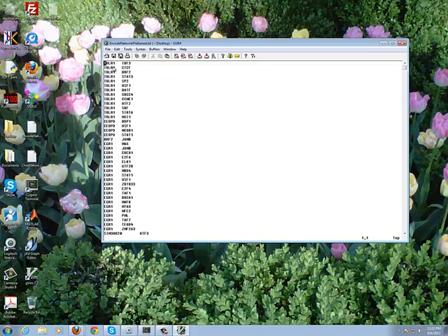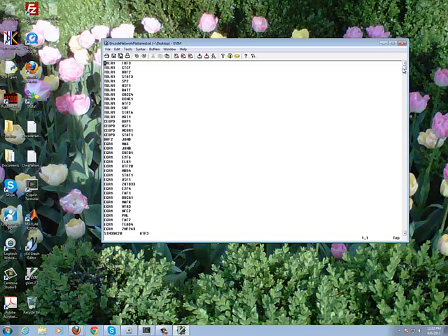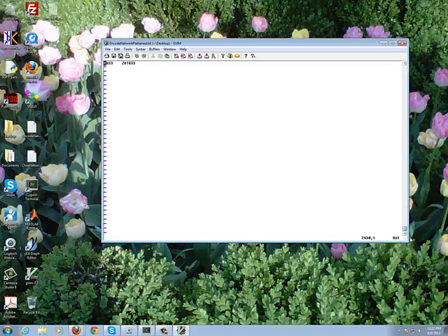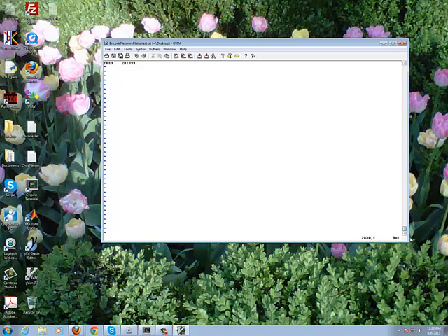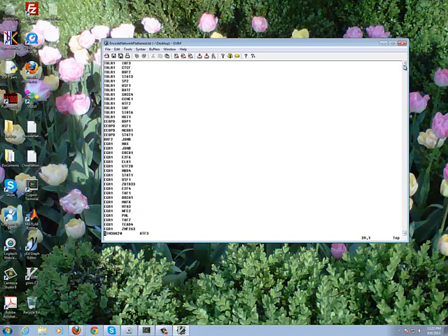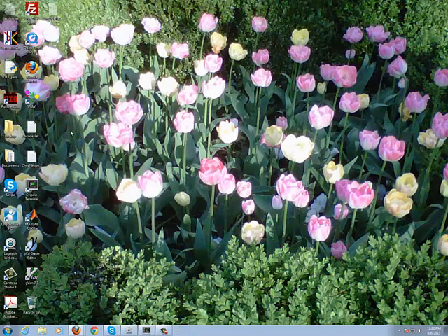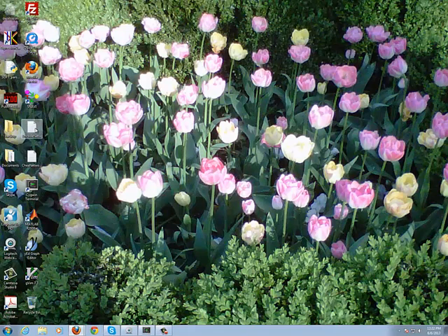So every row describes an interaction between those two nodes. And in this particular case, we have 2,430 of those types of interactions. And this is the encode network, flattened. So what we need to do in order for it to work with this canvas script, we have to add another column to that network.